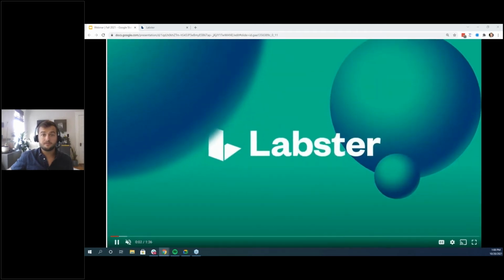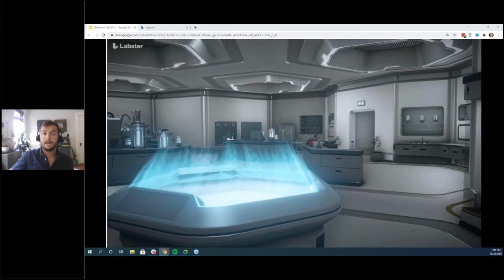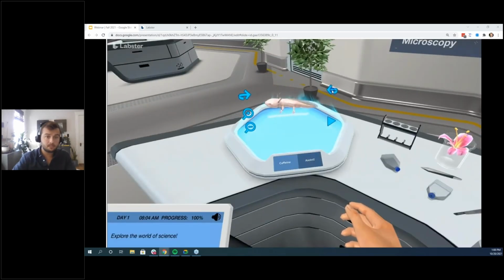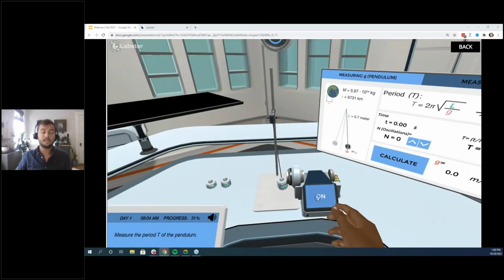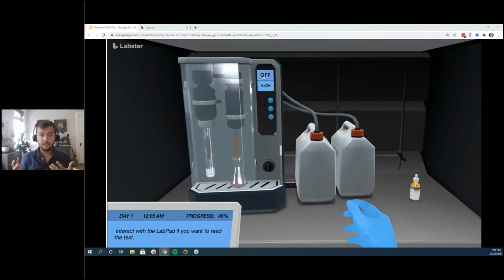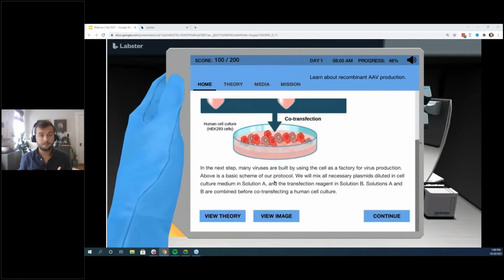Now, in a minute, I'm going to jump into our catalog, but I want to walk through this video pretty quickly. So at our core, we have about 218 gamified virtual labs across many different disciplines. They incorporate real experimental data and algorithms that allow students to change variables and observe outcomes the same way as they would in a real wet lab. Now, the simulations can take anywhere from 5 to 50 minutes to complete, and they can be paired with labs or lectures since they're both technique and concept focused.